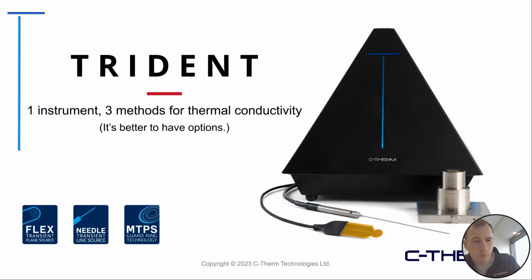The one in the middle, we won't be talking a lot today about, but is very useful in polymer melts. In other applications that get quite sticky, or you're worried about bonding the material, that stainless steel needle probe is sheathed in stainless steel, so it's a very robust sensor and great for some of those situations.